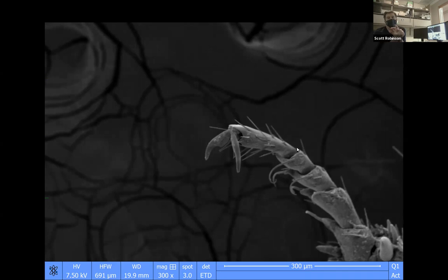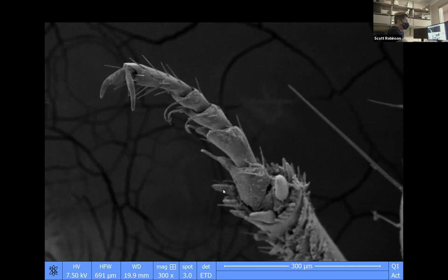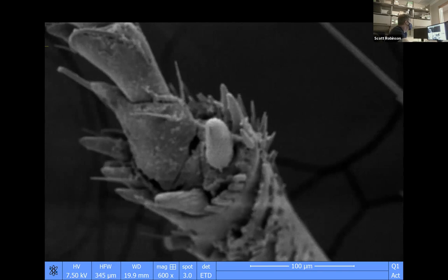They have an exoskeleton. And what we're looking at right now is the leg of this beetle. It has individual segments that are called tarsi, and then it has claws at the tip. And then it has little setae on it. And some of those setae are so that the insect can feel when it moves its arm. When it bends its arm, the setae will tell it that the different tarsi are touching each other so that it can feel that it actually moved. It's kind of interesting, a different way of living.